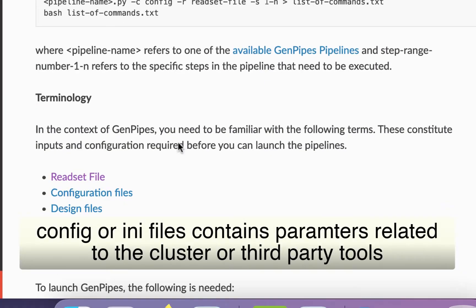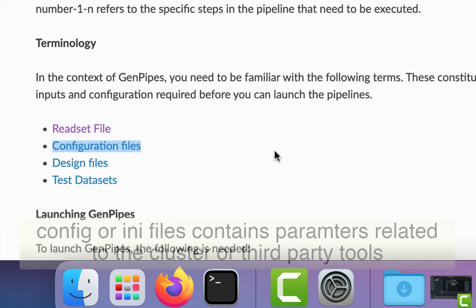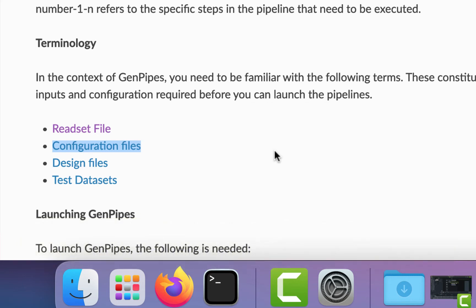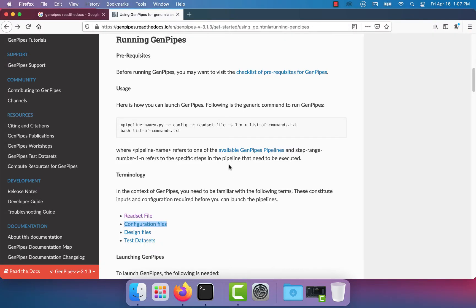Configuration files, or ini files, contain parameters related to the cluster and the third-party tools. These configuration files are customizable, so you can use them to adjust different parameters in the pipeline.